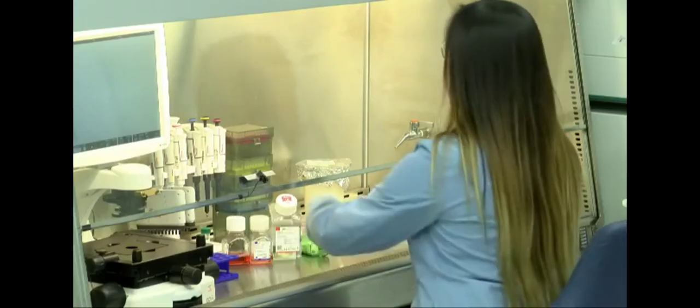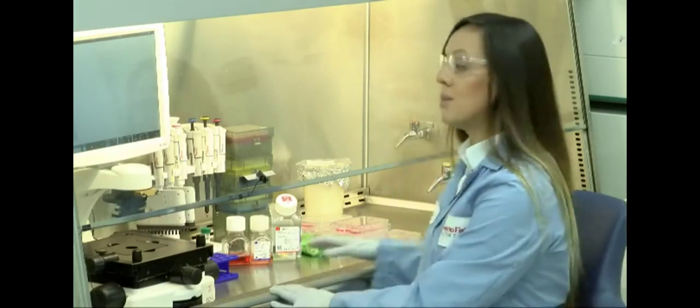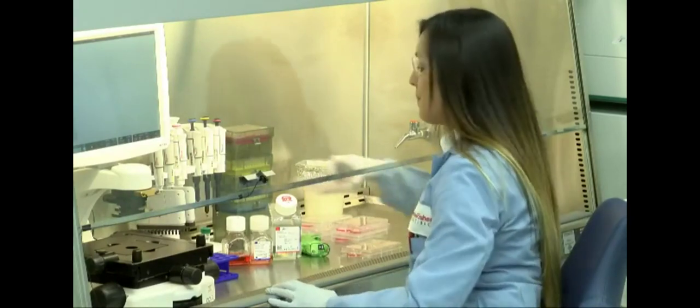So the first step on neuronal culture is actually day one or day zero. You're going to replate your PSC culture back into the same matrix that you started with. So for example, I have mine in StemFlex and Geltrex. So I'm just going to replate in StemFlex and Geltrex again at 300K per six well plate. So I had this right here.